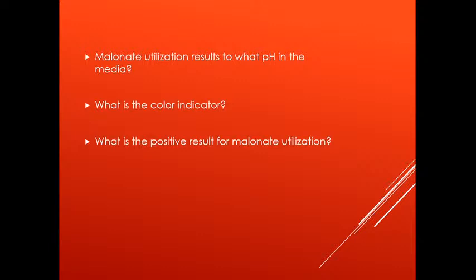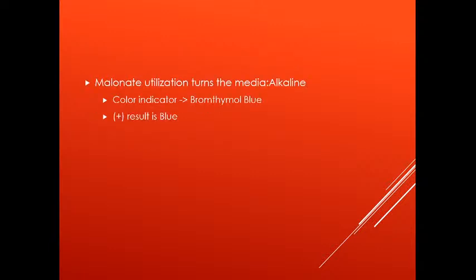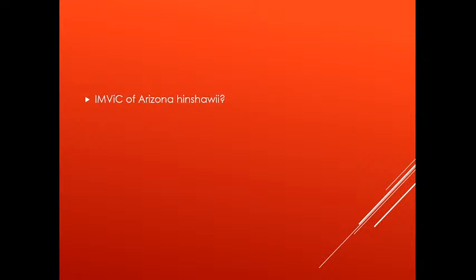It's an agar-based media, a solid media, sorry. And the color indicator is bromothymol blue. The positive result is, of course, blue. It's like Simmons citrate agar. Okay, now, the IMVIC result of Arizona is negative, positive, negative, positive. Okay, negative, positive, negative, positive.